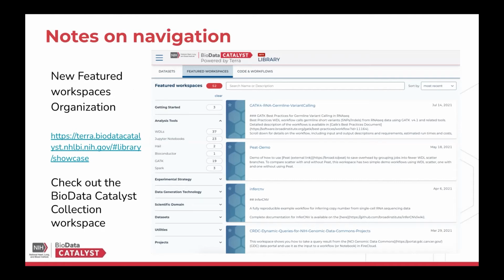They typically include an example data set, configured workflows with Dockers that can run on the example dataset, or configured notebooks. They also have good documentation describing what the analysis does. Some of them provide cost and time estimates for running the workflows. It's worth a visit to this page, and so I put a link for you here. You can also clone these workspaces to run an analysis you find interesting on your own data.